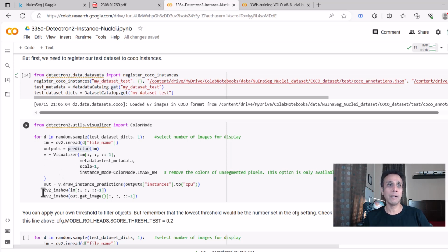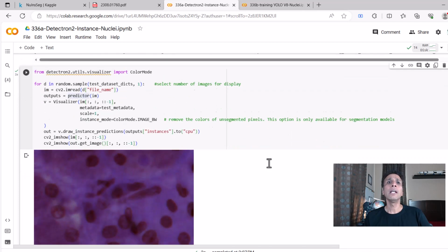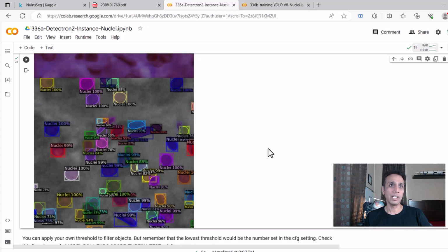That's as simple. And I'm using OpenCV, and because this is a Colab notebook, I cannot just do cv2.imshow. There is a function called cv2_imshow. That's exactly what I'm using. This is one of the things we imported earlier. Okay, so with that information, there you go. That's the image. Oh, that's a pretty good result. I'm super happy with this.